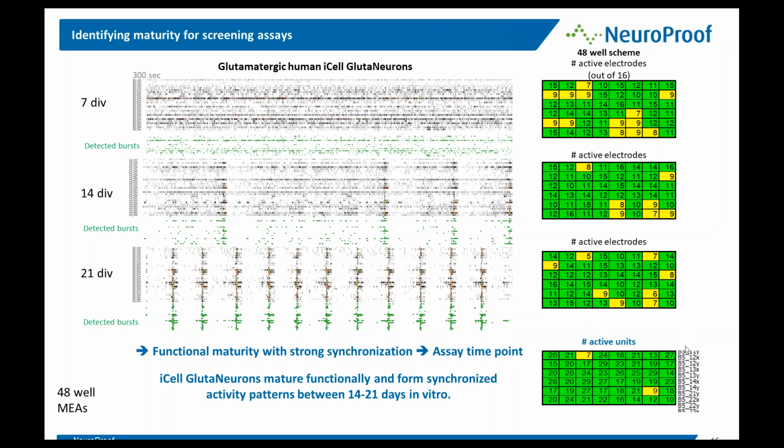And what we do here at NeuroProof is split up to 2 different neurons per electrode and end up with up to 30 different neurons we record from. Now this pattern has a certain signature, and we want to understand how it is physiologically explainable.